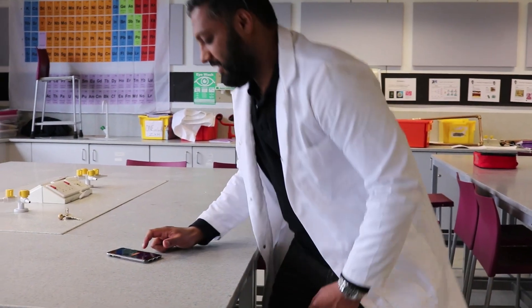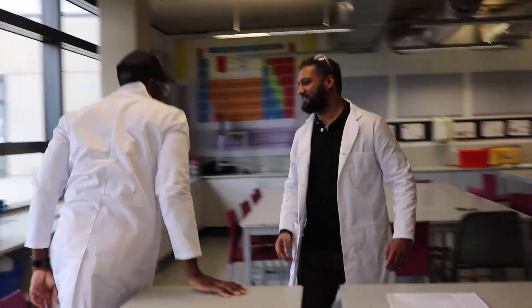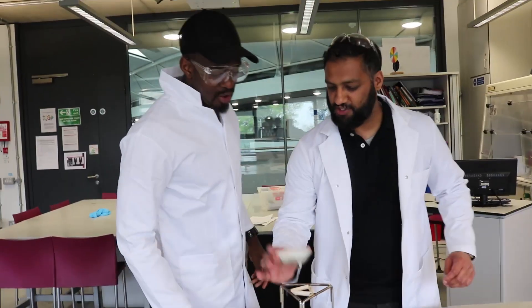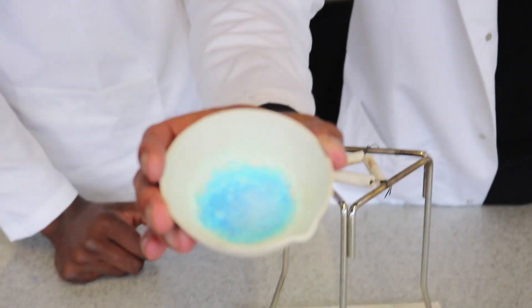24 hours later — look at that! You can see the copper sulfate crystals. 24 hours on, we have our copper sulfate crystals. Brilliant!